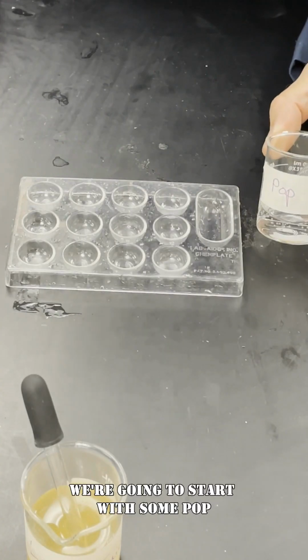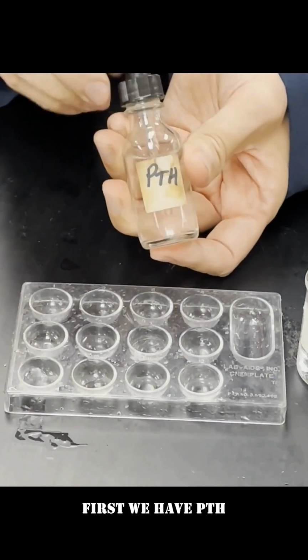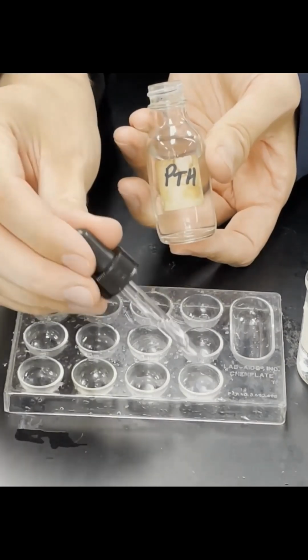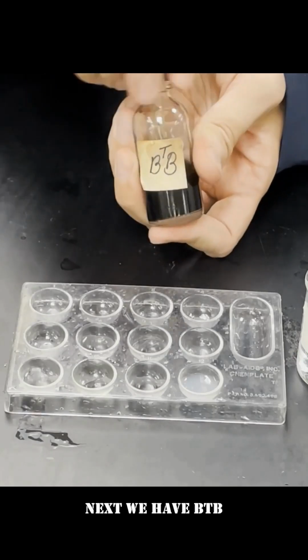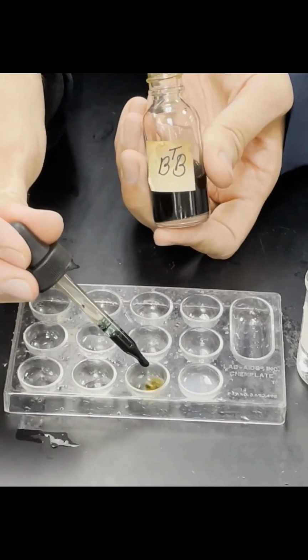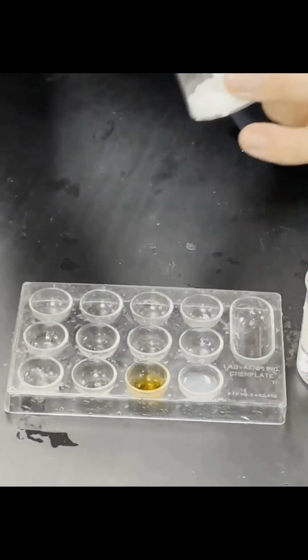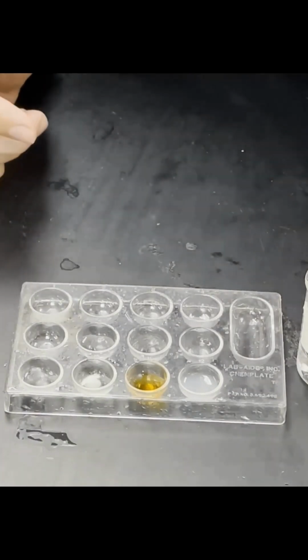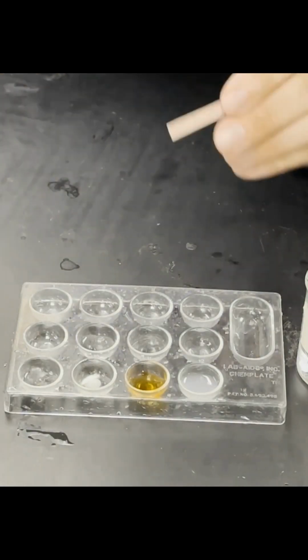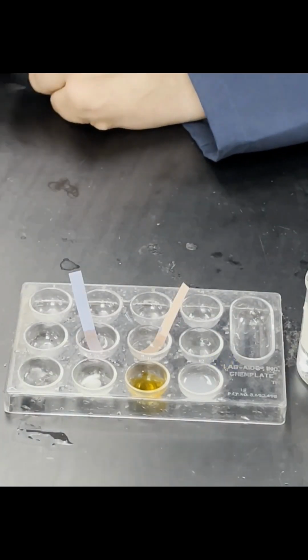Alright, so we're going to start with some pop. First we have phenolphthalein. Next, bromothymol blue. Carbonate. And finally, litmus paper. So is pop an acid or base?